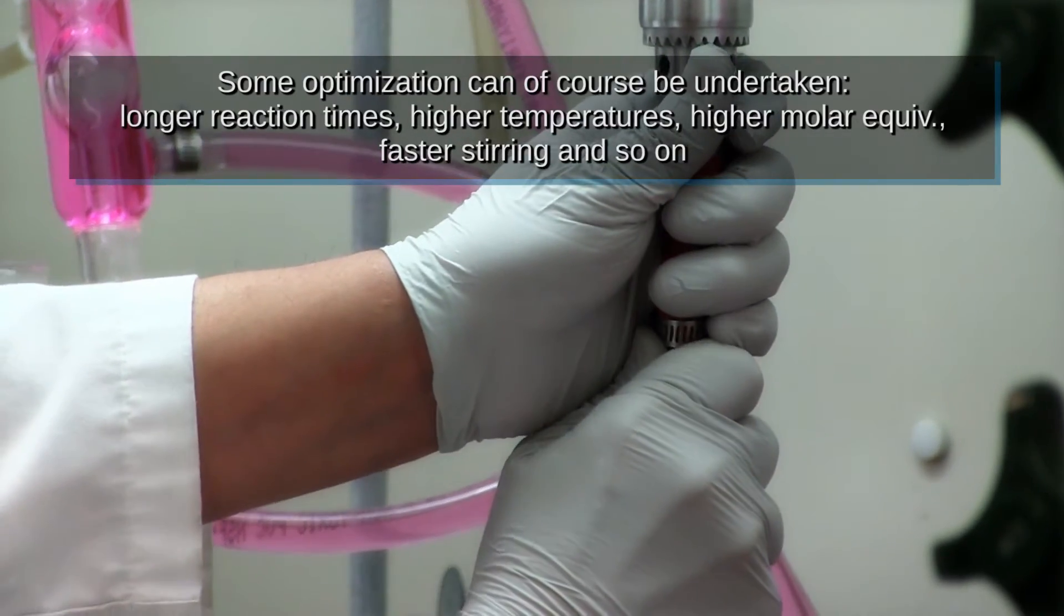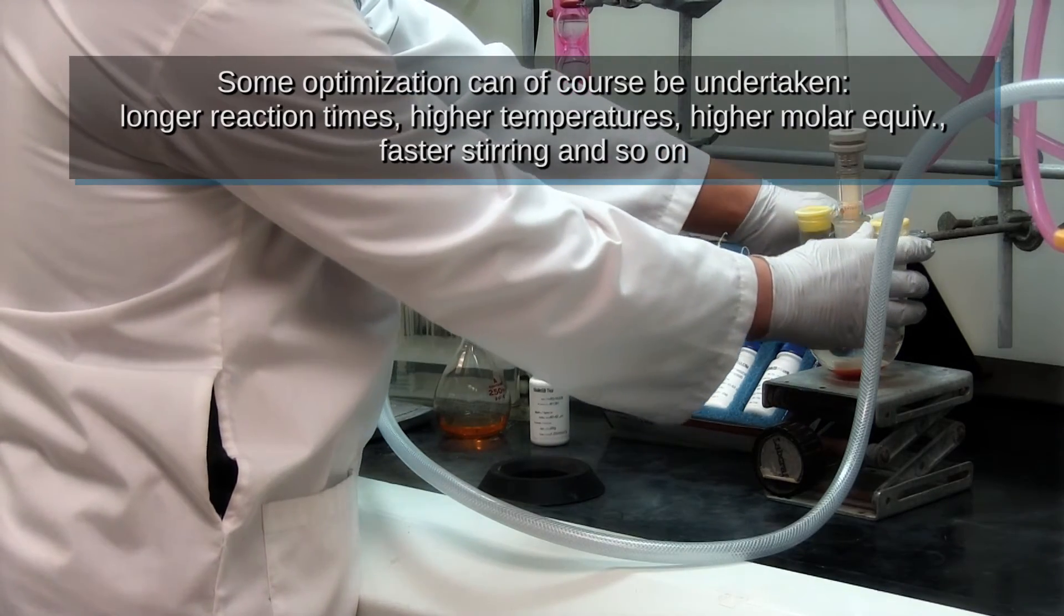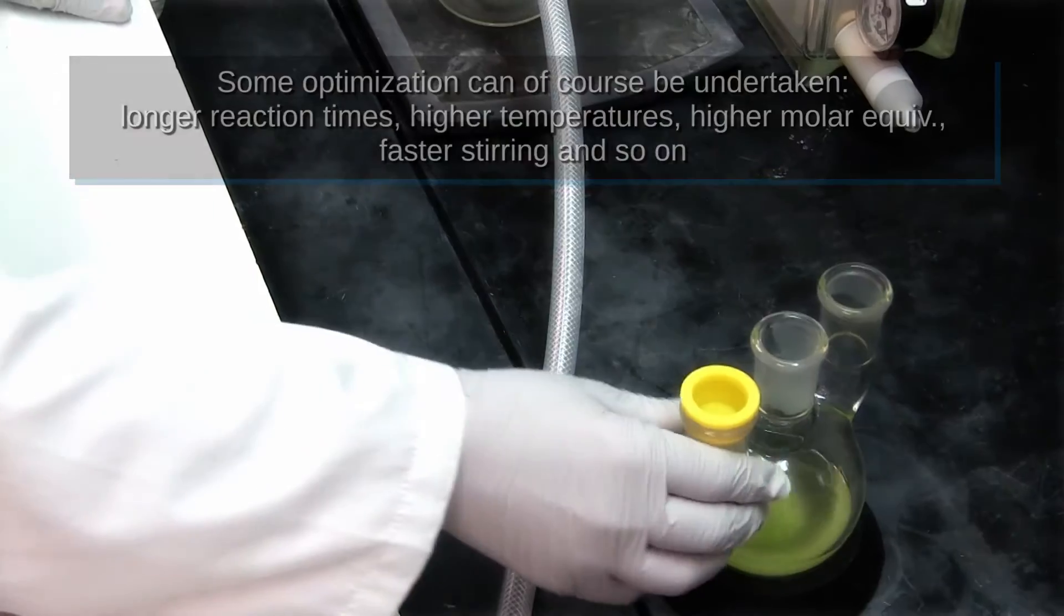Some optimization can of course be undertaken: longer reaction times, higher temperatures, higher molar equivalents, faster stirring and so on.